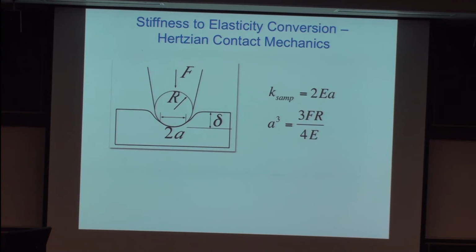So loss tangent at the end can look pretty simple. You do just regular tapping mode, and in the software right now, you just click on opening this channel loss tangent, and you get your data. Not necessarily easy to understand what it is, but the fact is to do it, it's pretty simple.